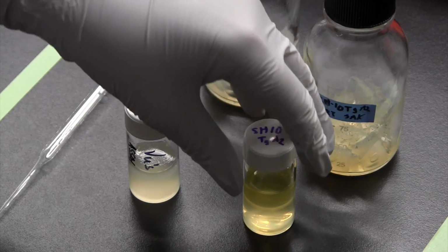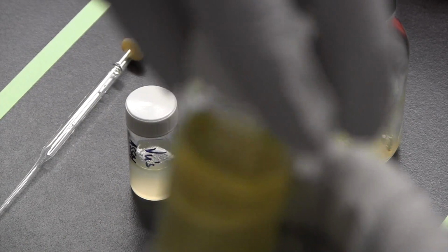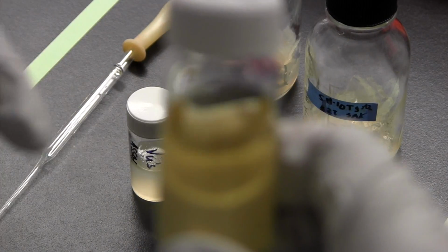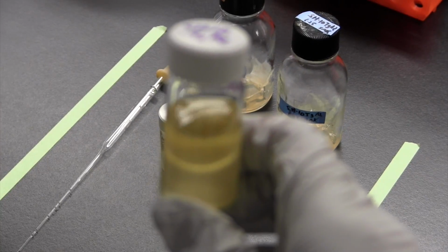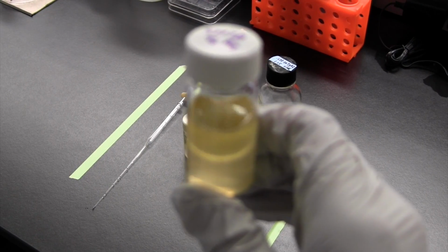So what you can see here are 2 very different extracts. This first one has a very clear, very distinguishable boundary between our organic layer and our aqueous layer. Okay, so the ethyl acetate layer is on the top, and what you're seeing is a nice clear boundary.